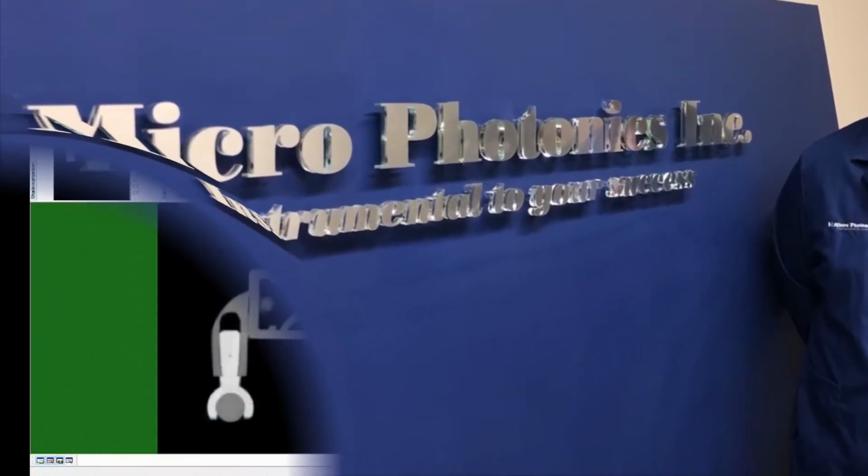Each month we're going to be going through some new tips and tricks videos to help you get the most out of your CTAn micro CT instrument. Let's go ahead and jump into this month's tip.